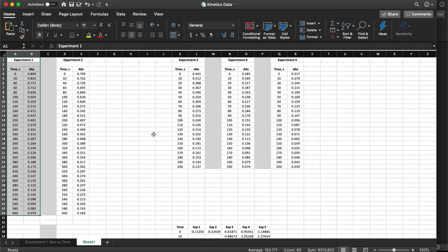And then we'll be including some of these other experiments as well, because they're all going to have a purpose as we go through and look at things. But you see basically you have time data and absorbance data, and very similar to what I was just showing a second ago, we see our absorbance constantly decreasing for all of these. Only our time here is in seconds instead of the minutes I had, and so we see the changes not quite as drastic as maybe what I had in my previous plot. But the same general trend is going to apply.